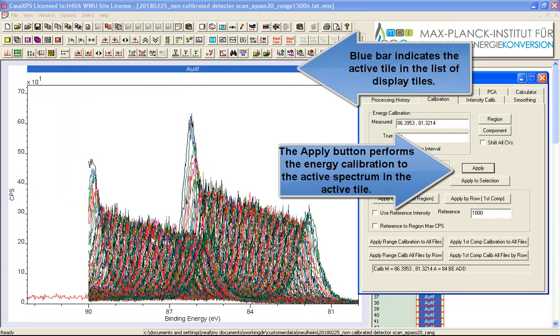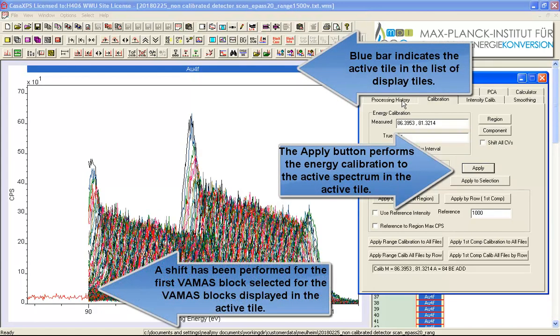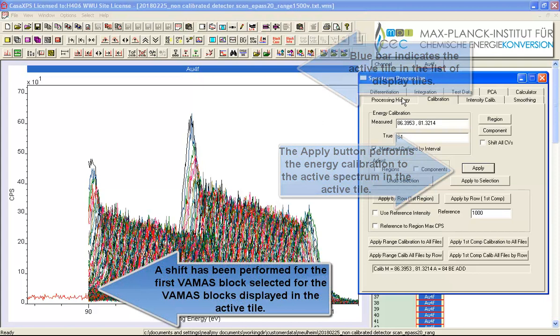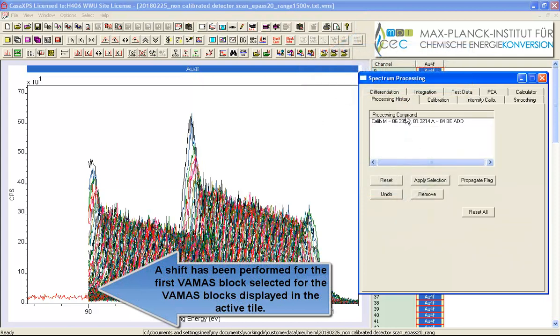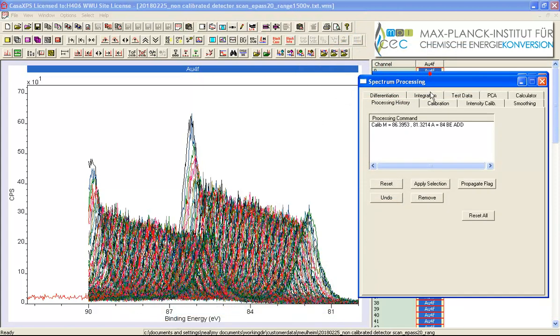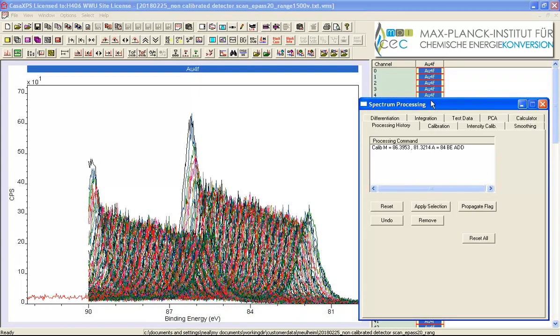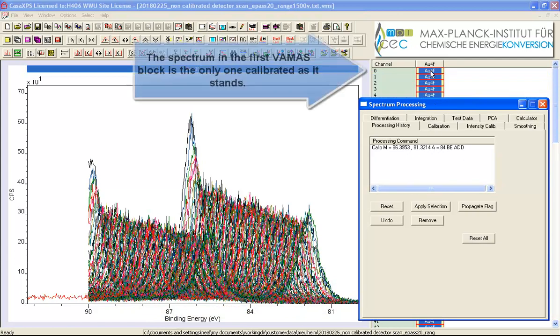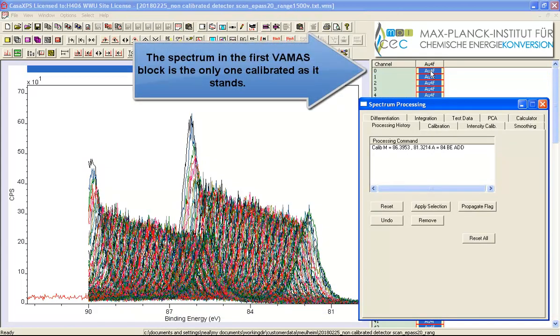And you can see that something has happened but it hasn't happened to all of these data and that's because only one of these, the first one in the active tile, the first one that was selected that is, has had this processing operation applied to it.